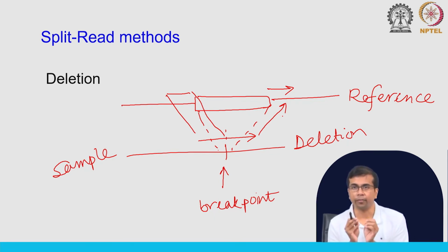So, one idea you probably get now in general is that we can use this distance between reads or this split mapping of reads to identify the occurrence of certain SVs, and then of course, we can dig deeper and identify the actual SV that has happened, whether it is insertion, deletion, etc., depending on different cases and scenarios.